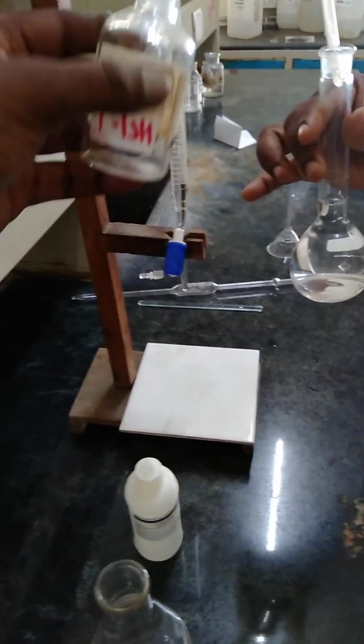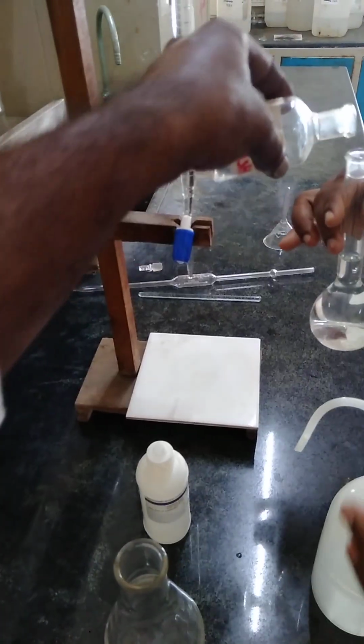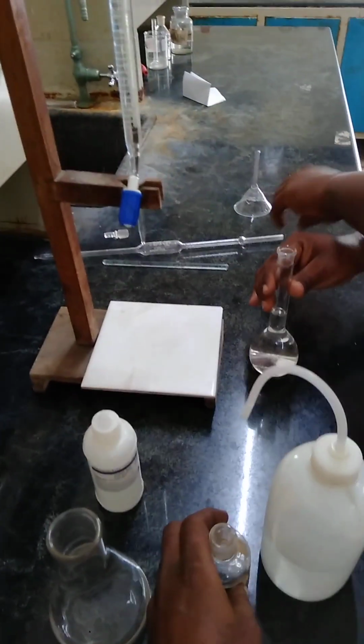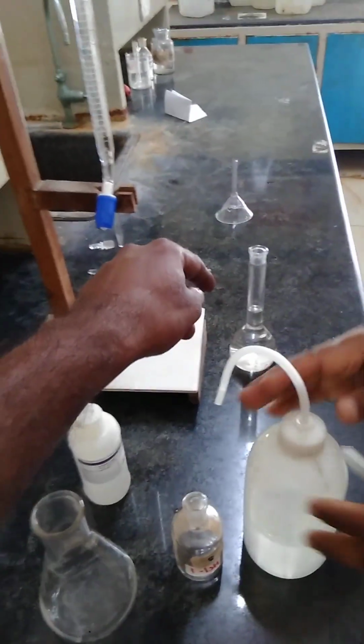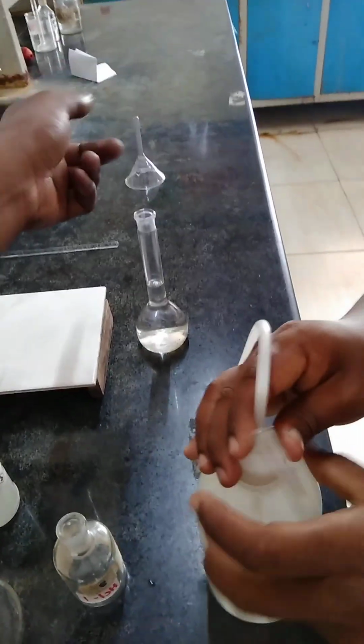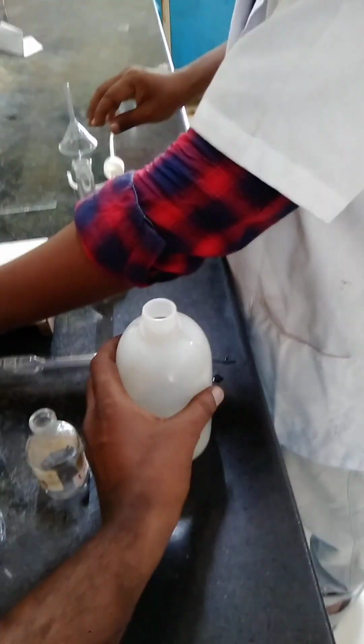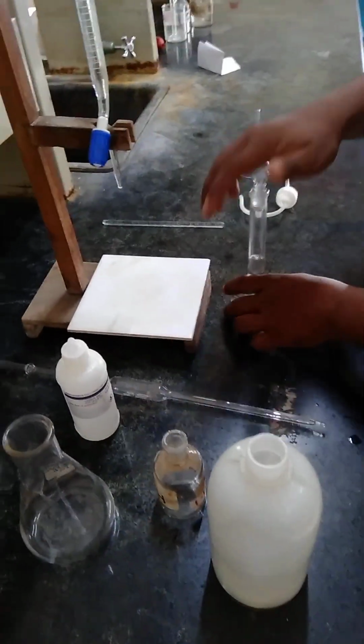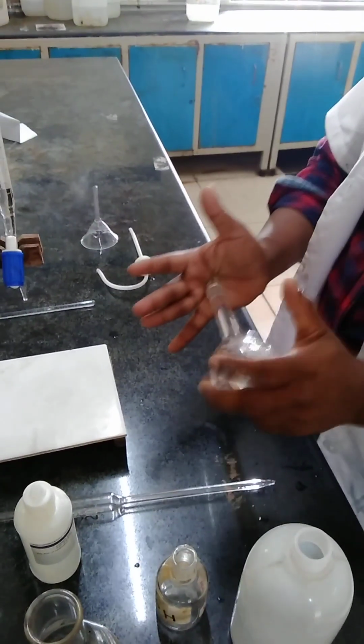Once you add the distilled water, then shake. At a single stretch, don't add water.